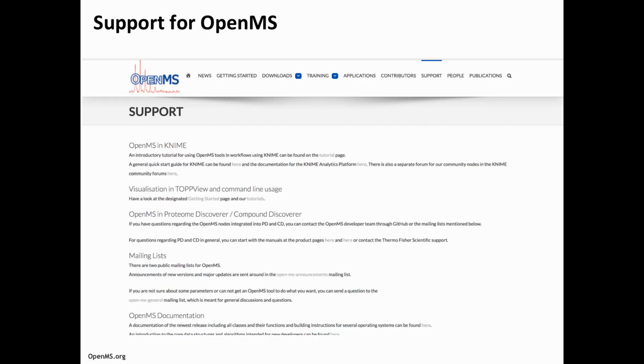How does that factor into OpenMS? We've recently developed nodes for Sirius, and you can try them out probably soon, not right now. But we streamlined this whole thing so that you don't have to go through their GUI, you don't have to go through a web interface, you can just submit that.